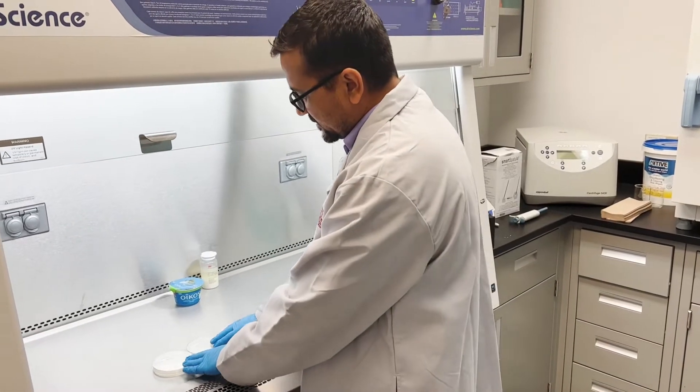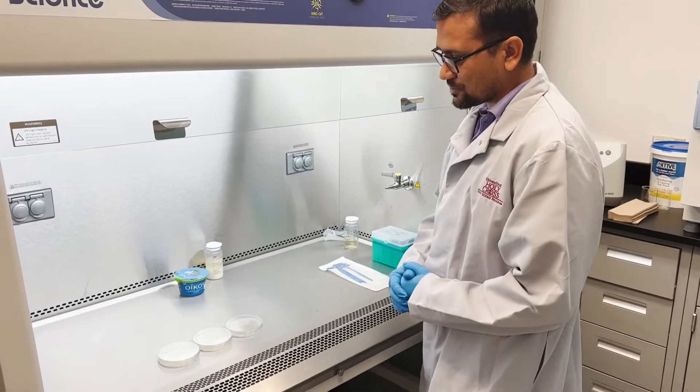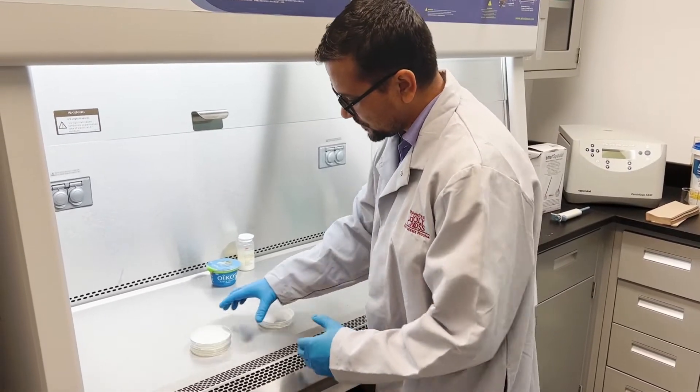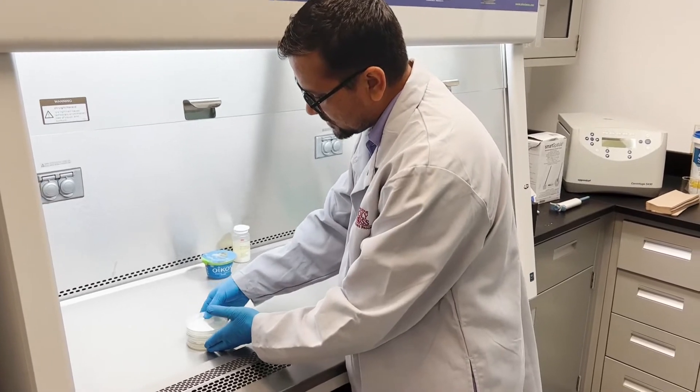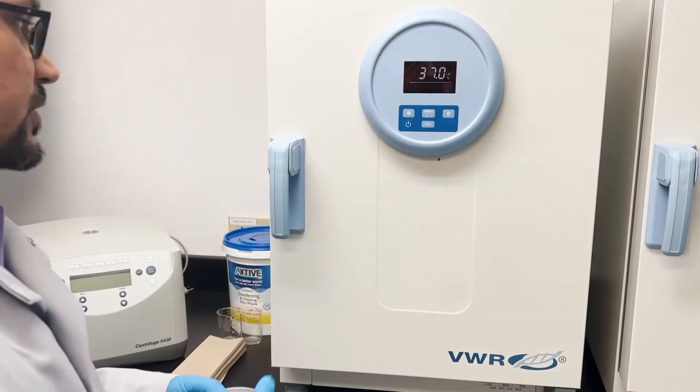I'm using this sterilized hockey stick to spread the sample on the nutrient agar plate. Now we've plated these three plates with the yogurt and peptone water mixture, and now we are going to incubate those plates at 37 degrees Celsius for 48 hours.